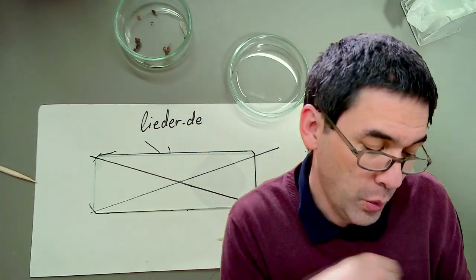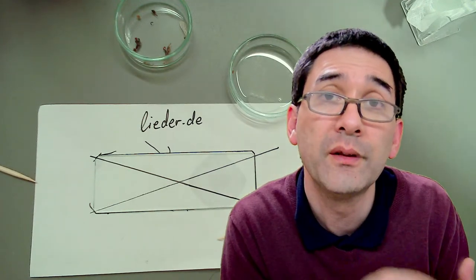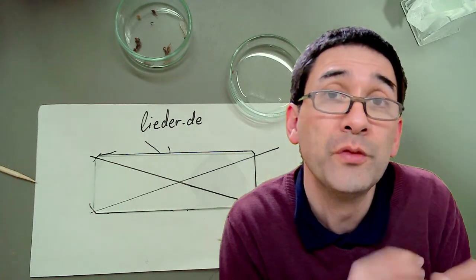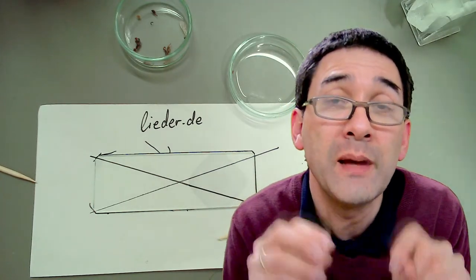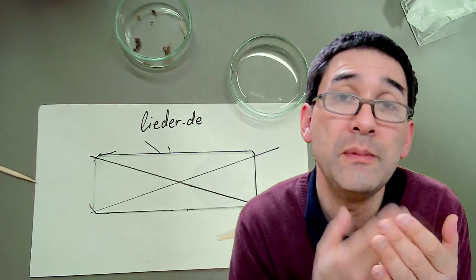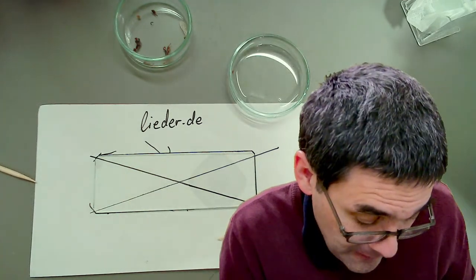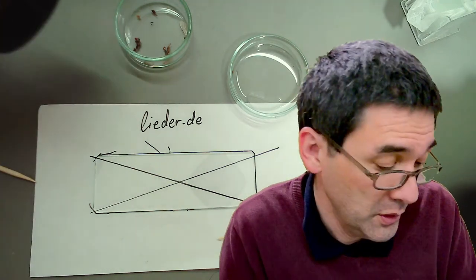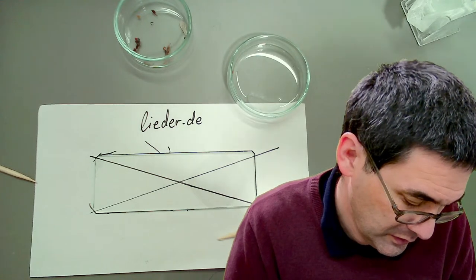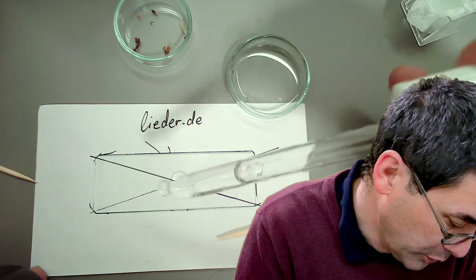And maybe the water-based mounting medium can make better contact with the mite, or maybe the soap also removes some of the grease or fat layer that might be on the specimen, which might also cause the glue maybe not to go too well on it. So I don't know. Okay. So what I'm gonna do now, same as before, PVA glue. Okay, and then I better label the whole thing. Otherwise, I don't know which one was the one with soap water and which one wasn't.